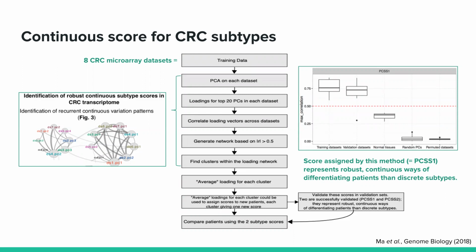And so this was a fairly bespoke approach with a lot of work on first doing principal components analyses, taking the loadings vectors, those are the vectors that associate the original gene expression values to the principal component latent variables, treating those as observations or just as vectors that were then clustered across studies to identify clusters of these loading vectors that were present in multiple studies.